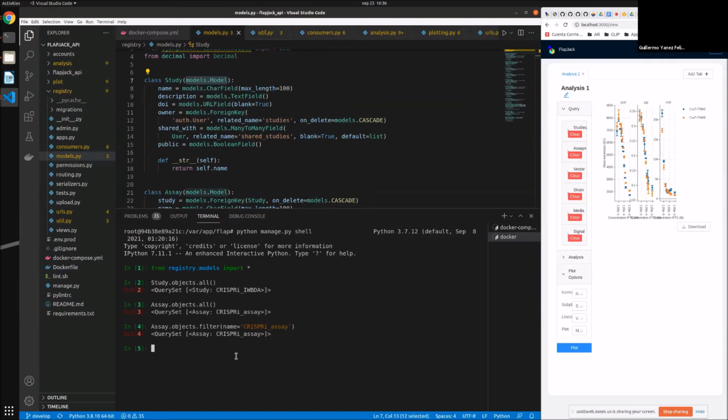And the second, remember that we are inside the API container. I will exit twice. Okay, so we are just in our command line again, and remember that we entered the container by executing the container interactively, the container called API, in bash. So we entered the API, and there we made this Python manage shell.